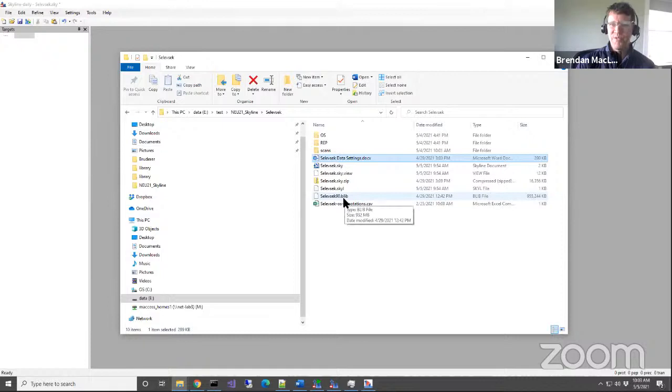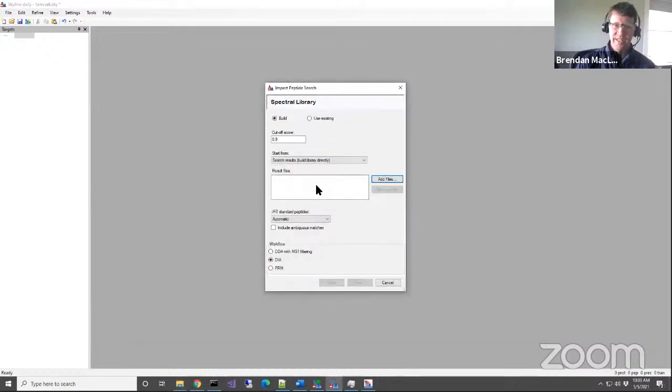So this is the blib file that was created, and you just saw a video of how it was created. And so instead of building it yourself, which would take every one of us at least 27 minutes, we're going to switch to use an existing one.